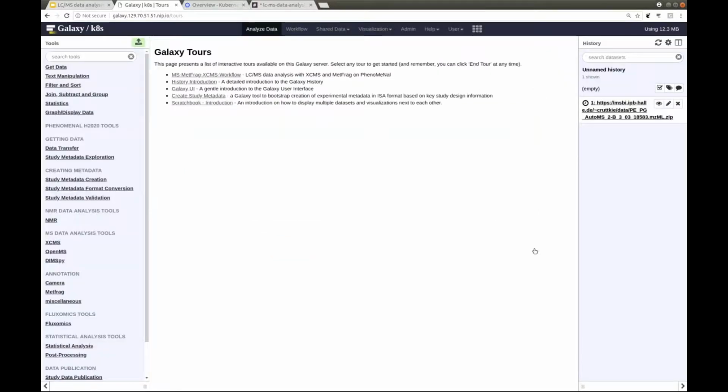And while we still wait, which takes a total of about 2 minutes for the data to be uploaded, I can also show you that here on the left, there's the toolbox. In the toolbox, you can search, for example, by keywords.